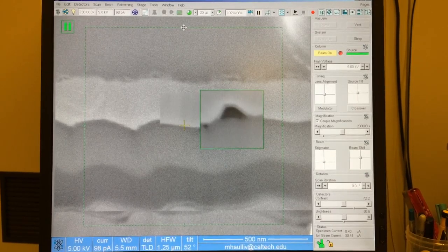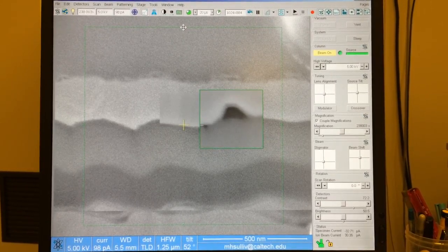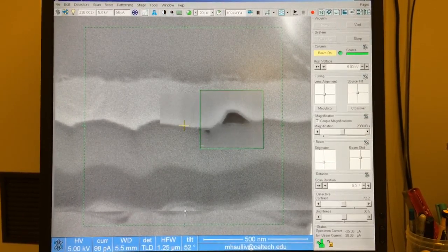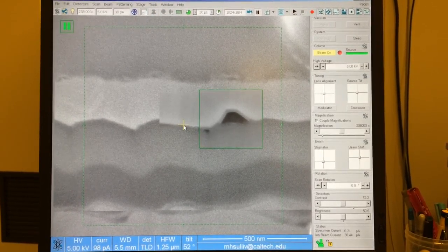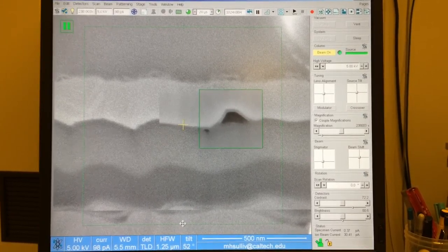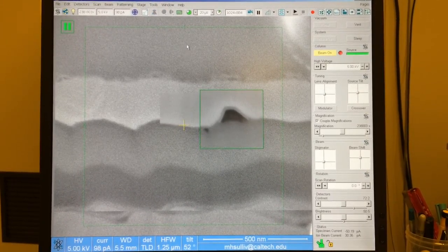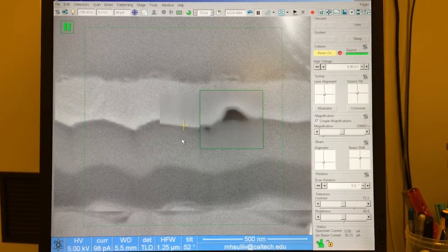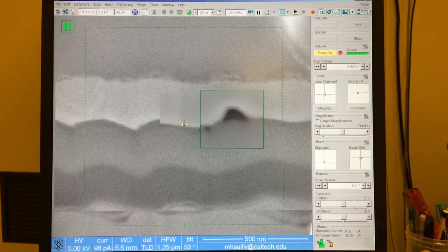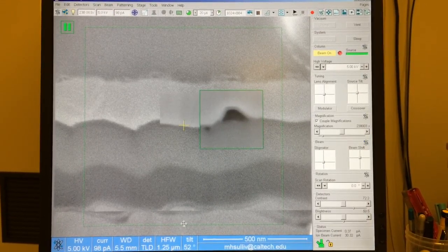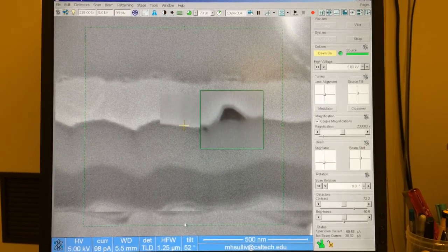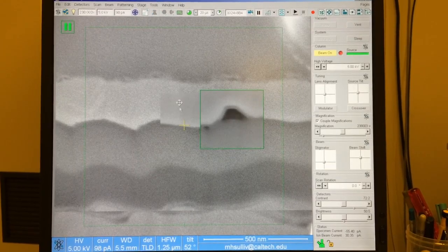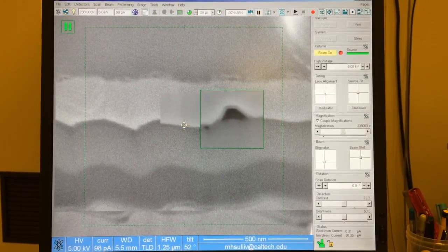Then we can compare the y-astigmatism, looking at the top versus the bottom. It's better on the bottom, so we'll adjust towards the bottom, release, and then repeat — comparing the bottom to the top. Still a little better on the bottom, so release it there and continue the process. You continue this until the astigmatism looks the same on the top versus the bottom, and the left versus the right. Now the y-astigmatism is fixed.